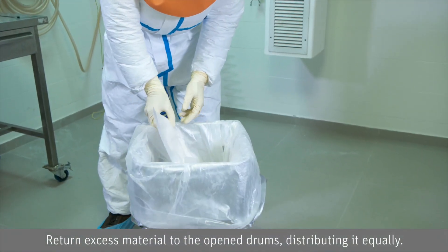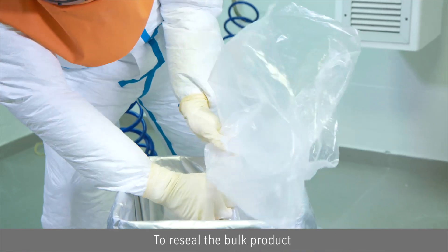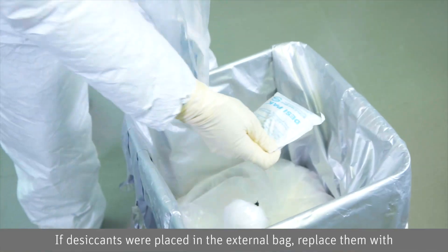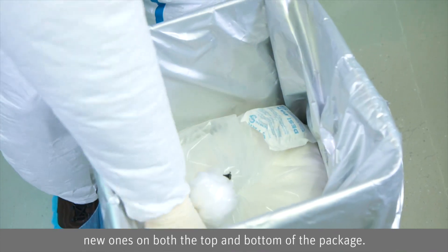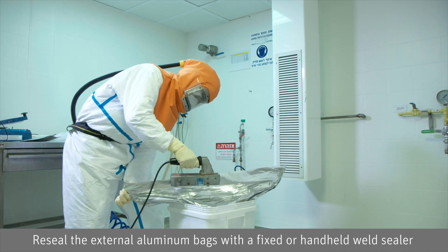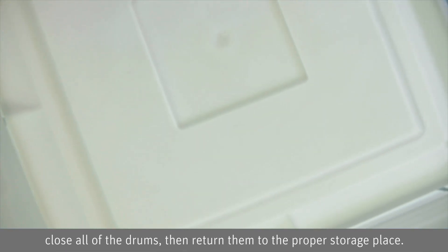Return excess material to the open drums, distributing it equally. To reseal the bulk product, remove the air from each internal bag and close it with a zip tie. If desiccants were placed in the external bag, replace them with new ones on both the top and bottom of the package. Re-seal the external aluminum bags with a fixed or hand-held weld sealer, close all of the drums, then return them to the proper storage place.